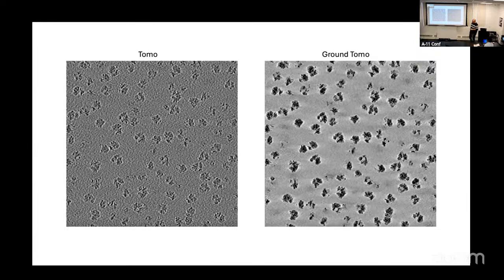It's based on, Alistair made a very good argument yesterday for the fact that we do not have perfect cryo-EM images to train a neural network to predict, right? Like, you have a noisy image, but you do not have a perfect version of that image that you could train the network to predict. But we built this simulator. Kind of a crazy idea, but we were like, we can actually do things that you can't do with a real microscope, with real cryo data. And so here's a simulated tomogram of ribosomes. And here is the ground truth, or what we call the ground truth.